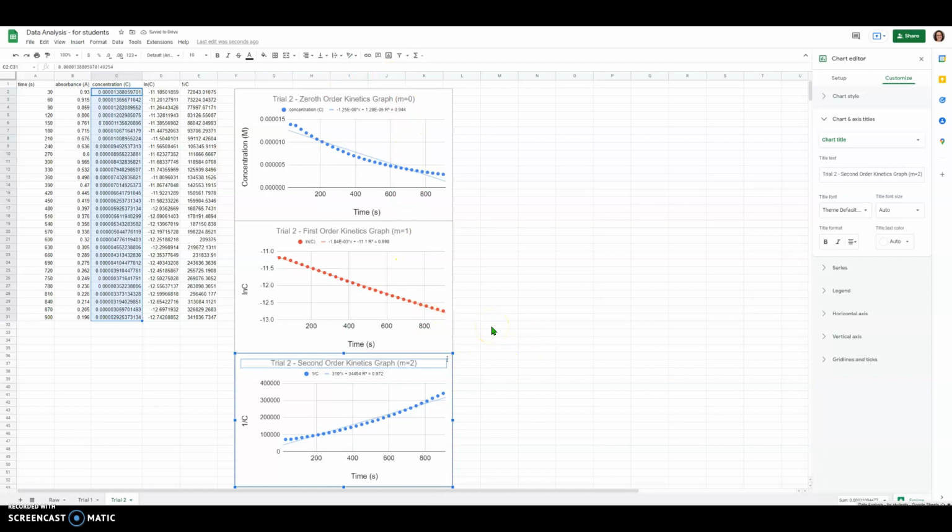For those of you that may be wondering why we don't just combine trial 1 and trial 2 in the same graph so that we could just have 3 graphs with the trial 1 and trial 2 data plotted, like for example, plotting both trials on this first graph. The reason for that is because if the data overlaps pretty significantly, it might be kind of hard to see the differences between them. But you are welcome to fiddle around with that.